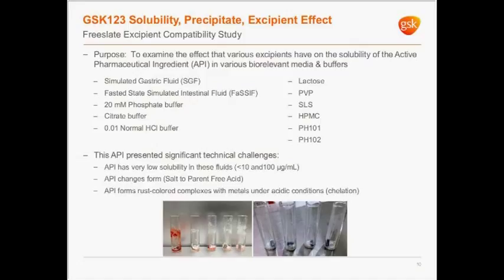2 of our CM3 robots are outfitted primarily as pre-formulation machines, and they perform liquid and solid dispensing, and they have the capability to measure pH, and one of them can also process viscous liquids. Our third machine has an optimization sampling reactor module, or an OSR. This is dedicated to chemistry reaction screening. Our lab is managed by Ken Wells, and we have 4 full-time scientists as well as a Drexel University co-op student contributing to the workflow. In addition to that, we have scientists from around the organization who contribute to the various work packages on a part-time basis as needed.